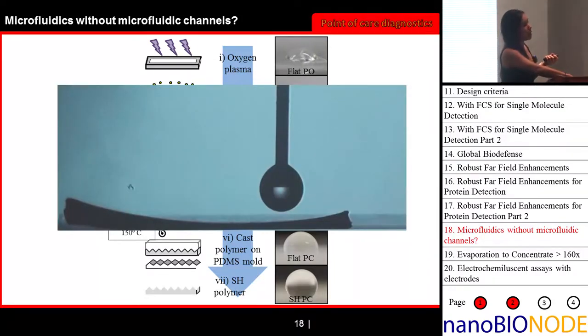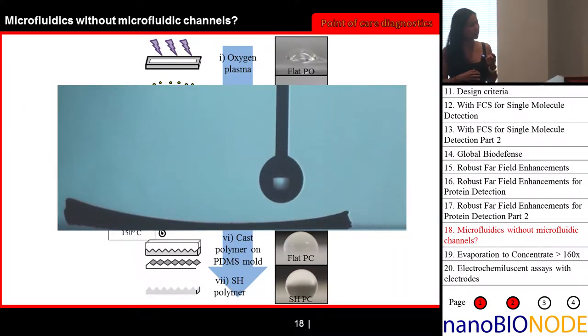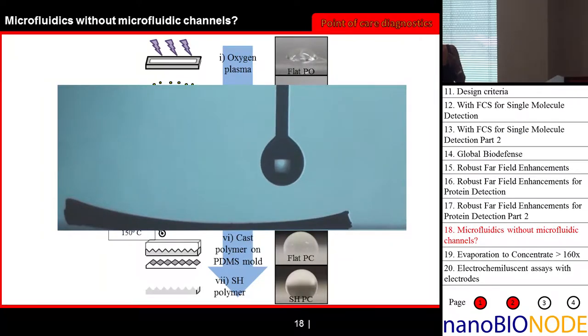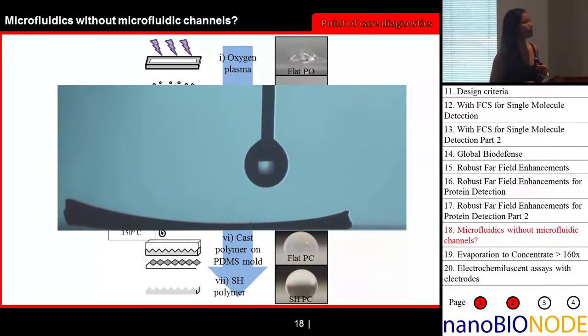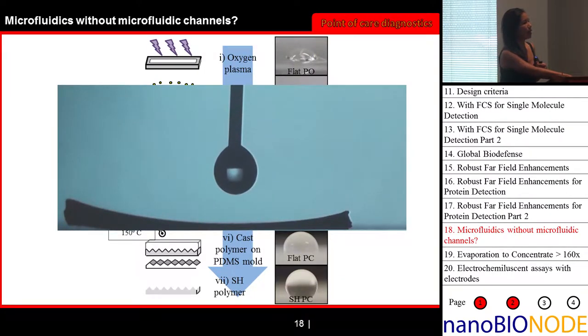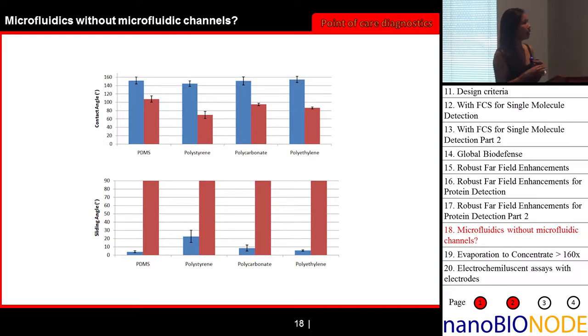So this is what the super hydrophobic surface looks like. This is us trying to wet down the surface. You see, it isn't really easy taking those contact angle measurements because it relies on a premise that you can actually wet the surface before you can take the contact angle measurements. And so this goes on, and we can't really wet it. But we can do this in a variety of different types of plastics. We can do this in pretty much every plastic that we tried.